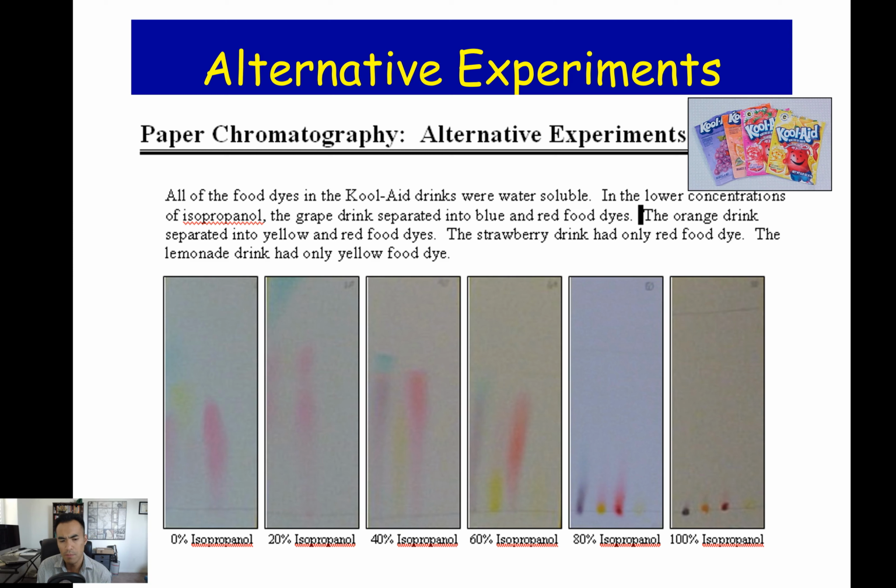Now, there's also another piece that you really want to take a look at, and that has a lot to do with why water is dissolving other substances. And again, there's this idea of hydrogen bonds, there is this idea of dipole-dipole movements that I want you to really explore and think about as you're doing it. So it's quite clear here that if I use 100% isopropyl alcohol, the separation is not as high. With isopropanol at the midpoint, you can see there's a little bit of separation, but obviously this is a poor choice of a solvent.